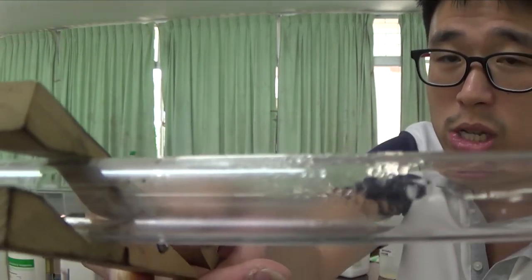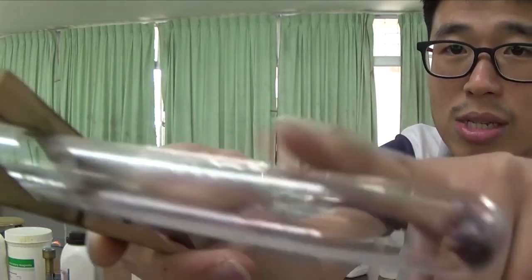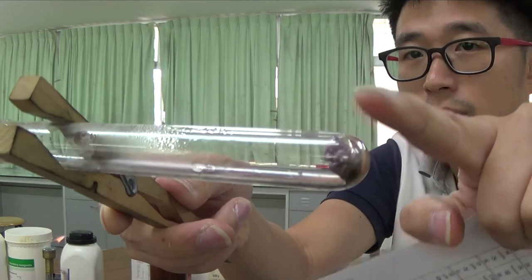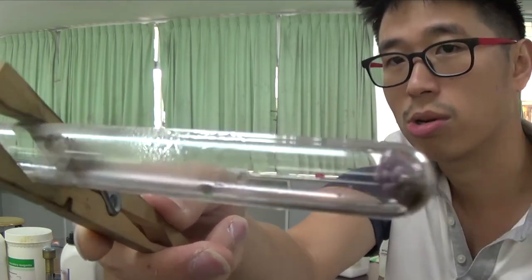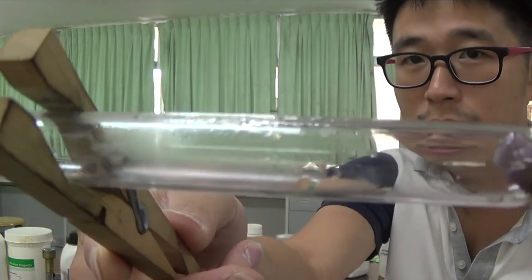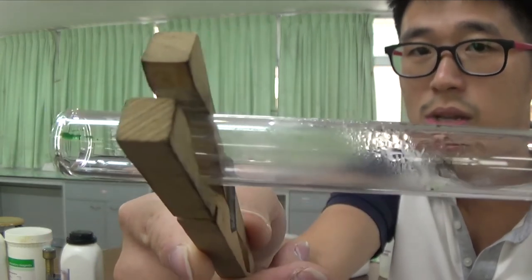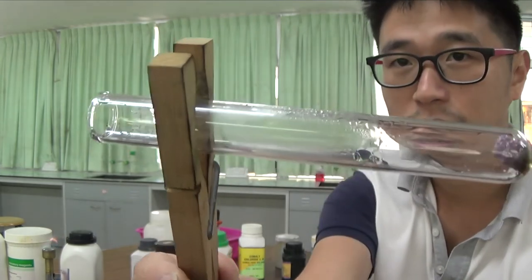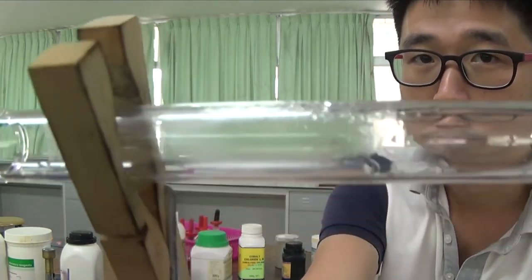You see a bit of moisture inside, it is not outside, colder end, hot end, so when the steam or the water vapor escape from the water of crystallization, it goes to the upper part of the tube, which is cool, it condenses to give you the water back. But you don't know it's water. Your observation is not a conclusion. Your observation is a colorless liquid formed on the upper part of the tube.